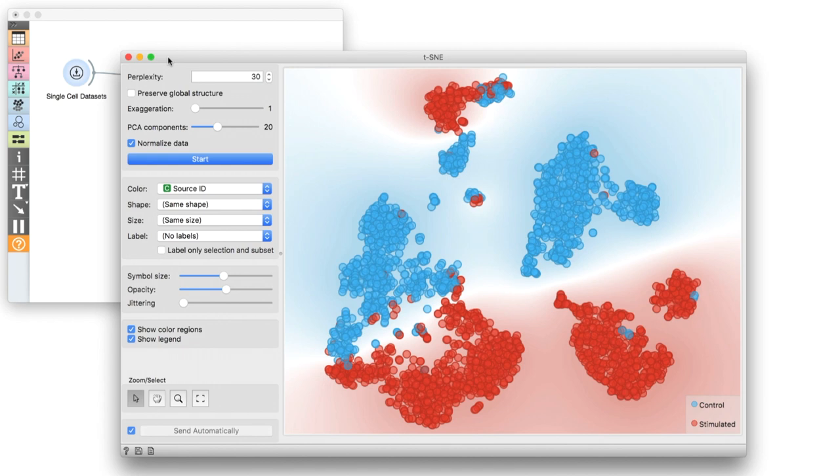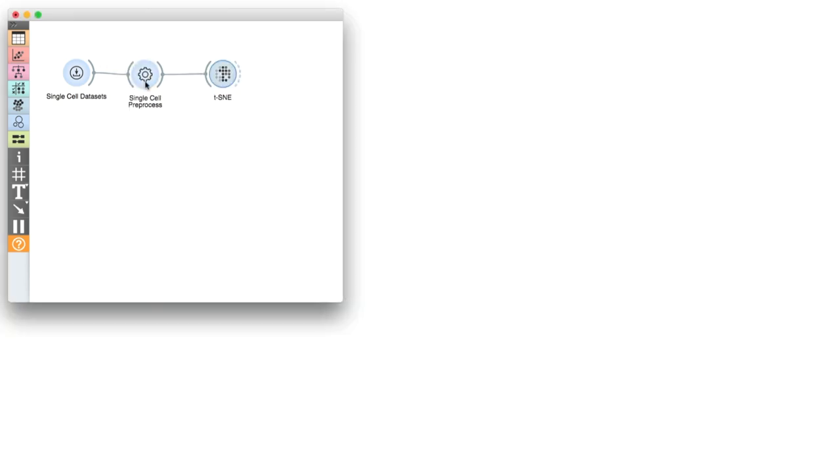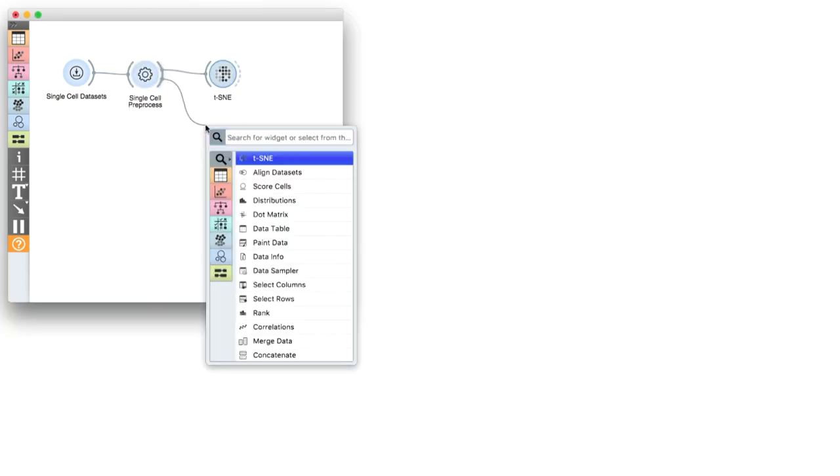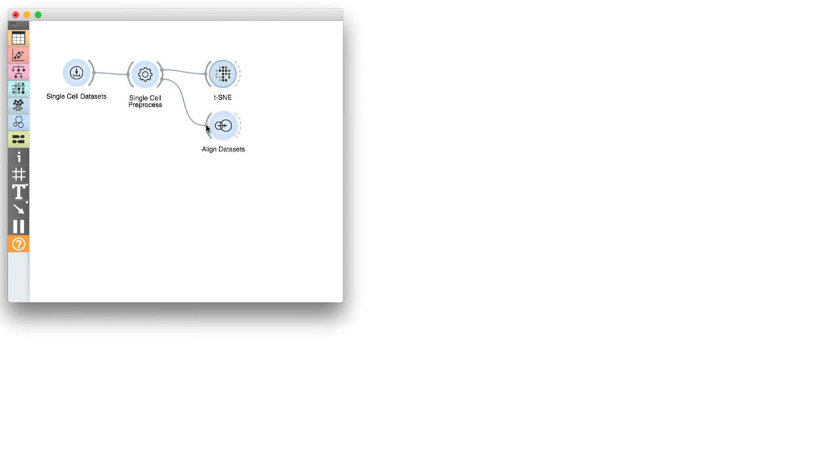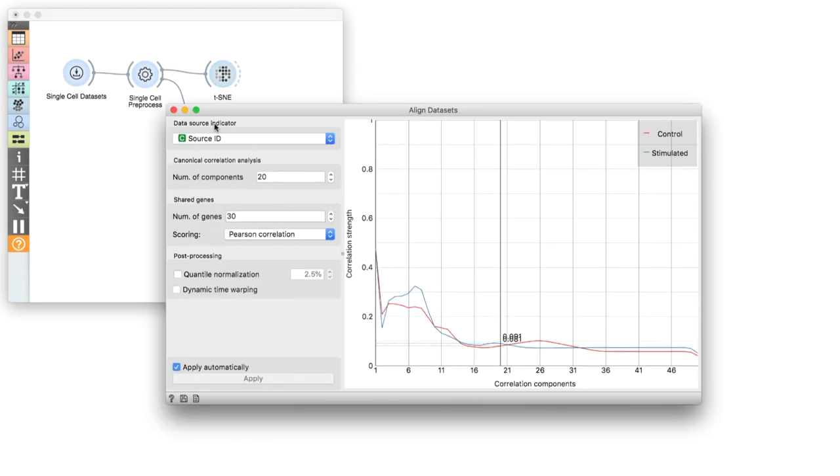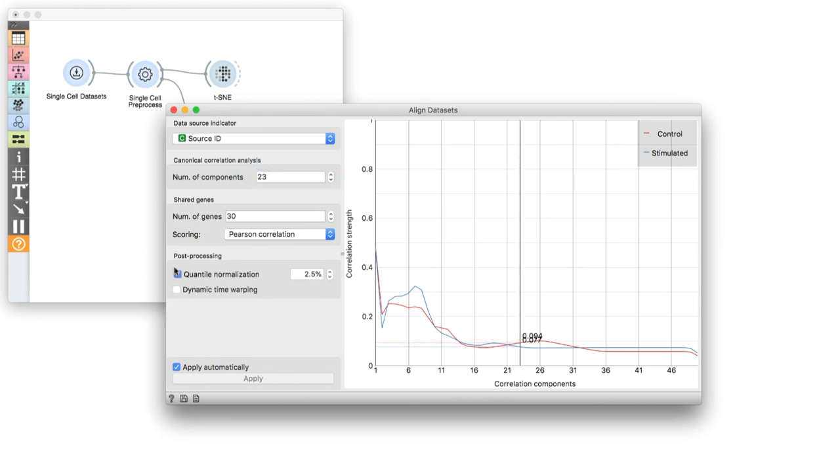Now, because the two experiments should contain similar cell types, we can attempt to match them with data set alignment. Data set alignment relies on canonical correlation analysis and finds shared directions in the space of the two data sets. Let's select 23 canonical components using the handy shared correlations plot.